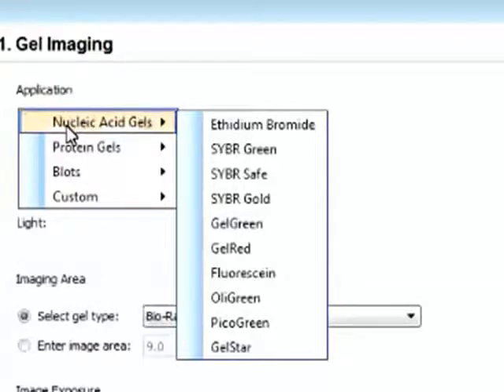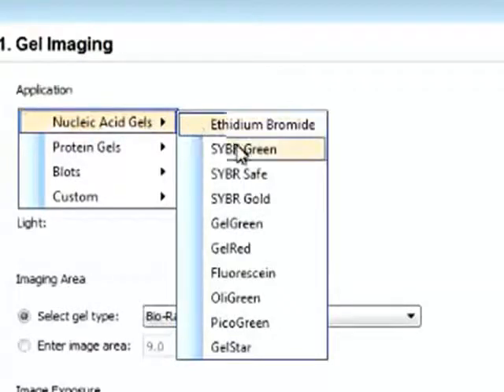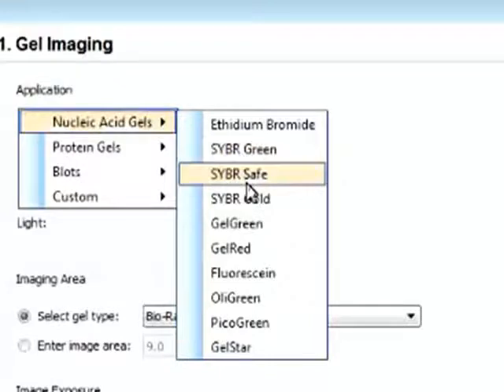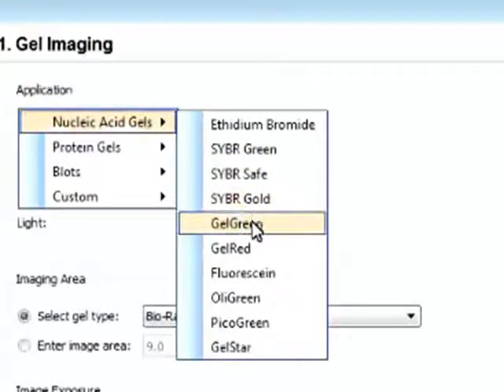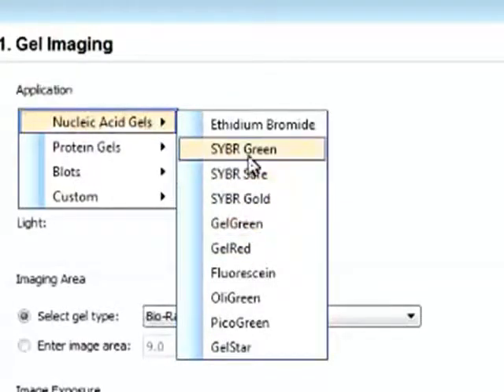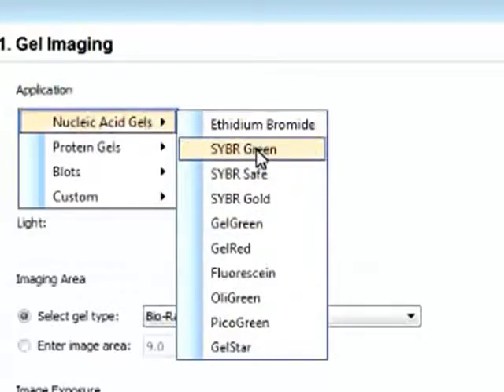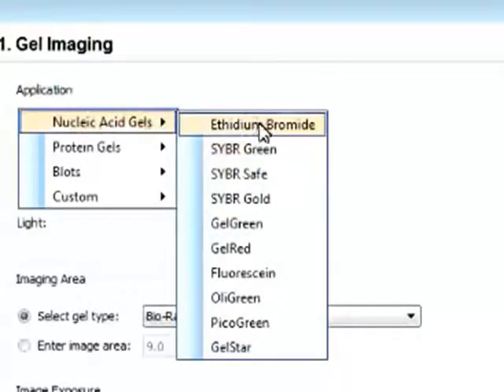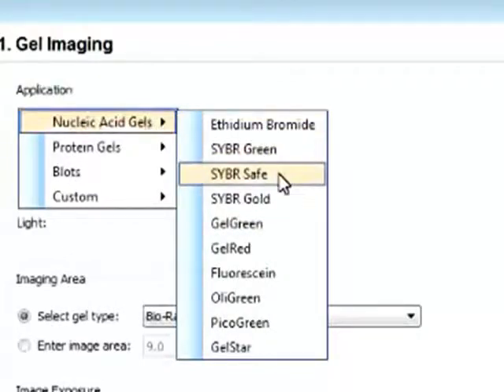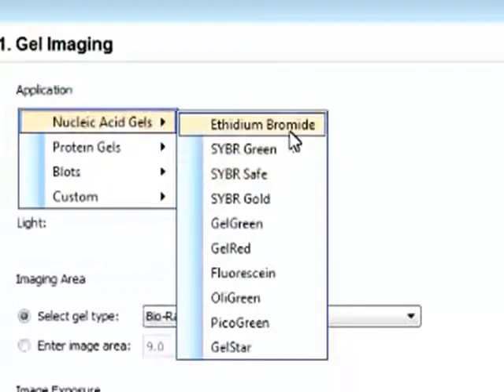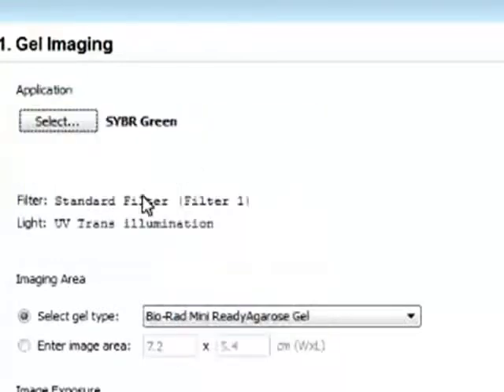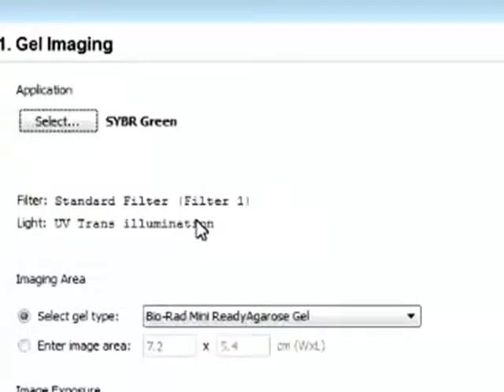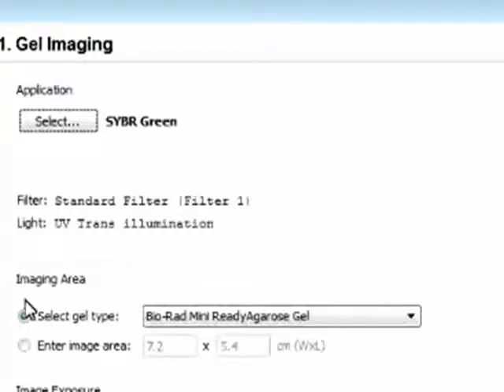So you can see that in the nucleic acid gels, we have all these dyes that are preset into the protocol. And we can select the dye we basically stained our gel with, from ethidium bromide, SYBR Green, or SYBR Safe. Say we want to look at SYBR Green. And now you can see that the filter is selected as filter one and the light source is selected as UV transillumination. And this is all automatic.